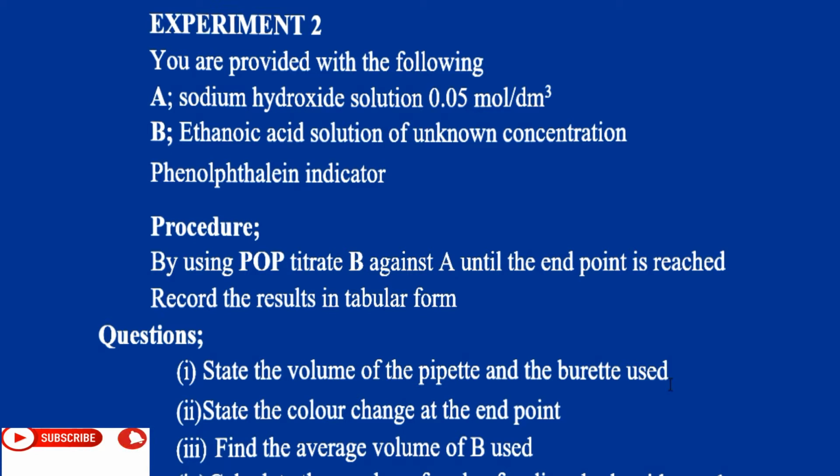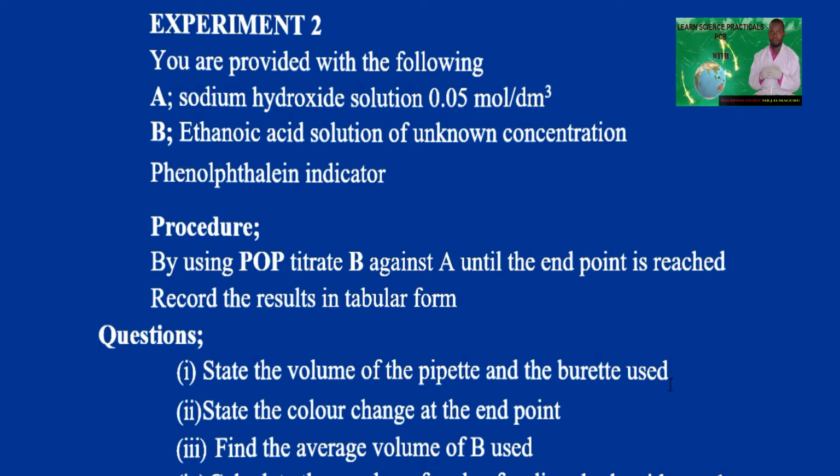So you are provided with the following solution. We are going to see how this question is calculated or solved, so you understand our lesson more. You can stop this video to take a note and to know how this question has been solved. So this is titration experiment number 2.